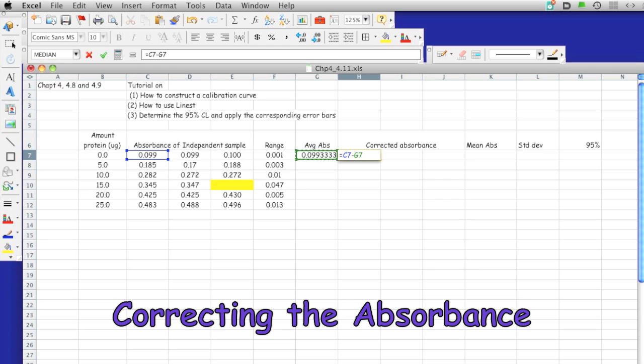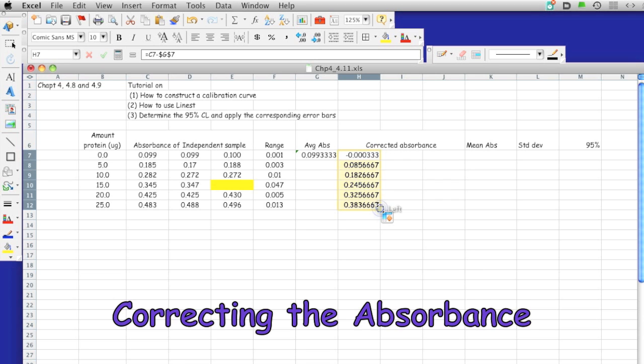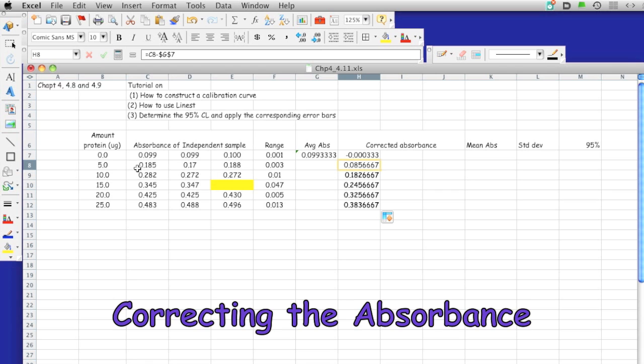I'm going to calculate the rest of these. If you notice the equation, this corrected absorbance is for this absorbance minus this correction, and this corrected absorbance is for this absorbance minus this correction, and so on. We're just going to apply this whole array for all these calculations.